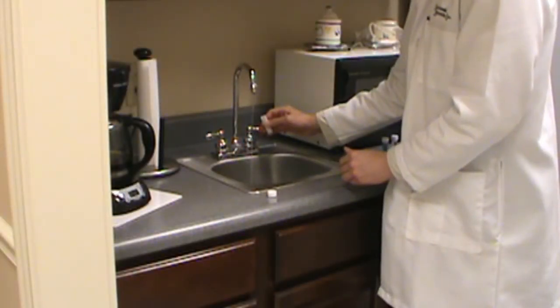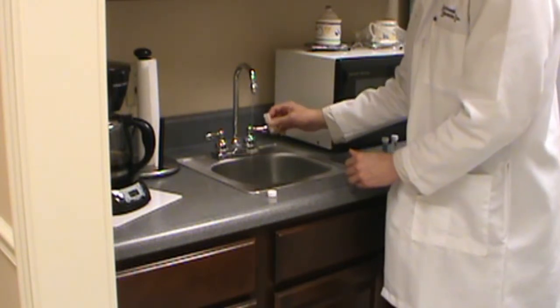If you're collecting water from a faucet, then you should turn the cold water on and let it run for about 5 minutes before collecting your sample.